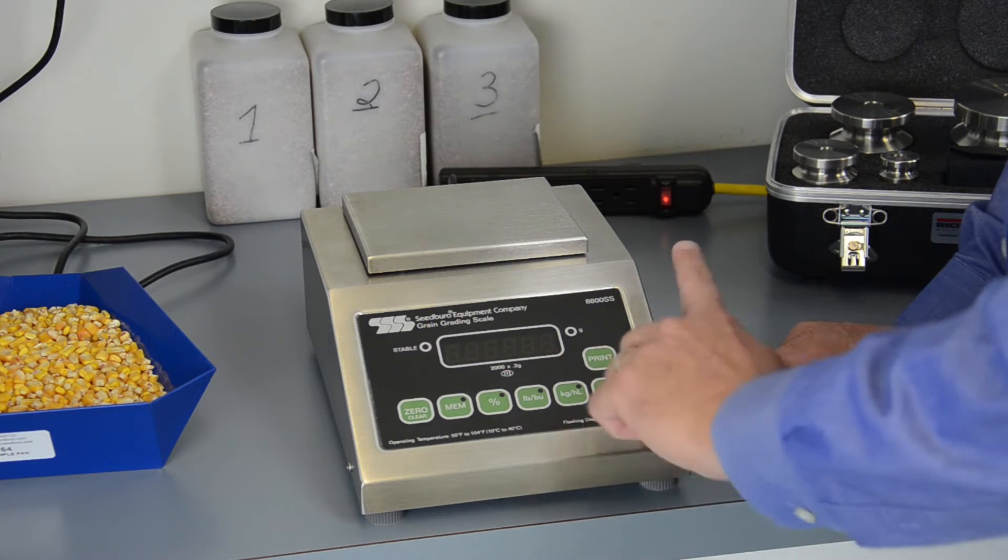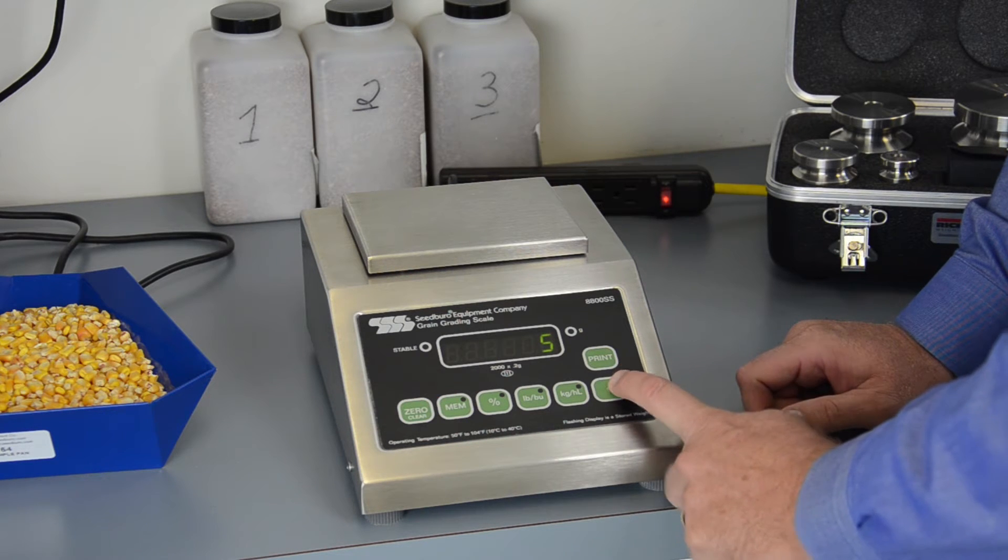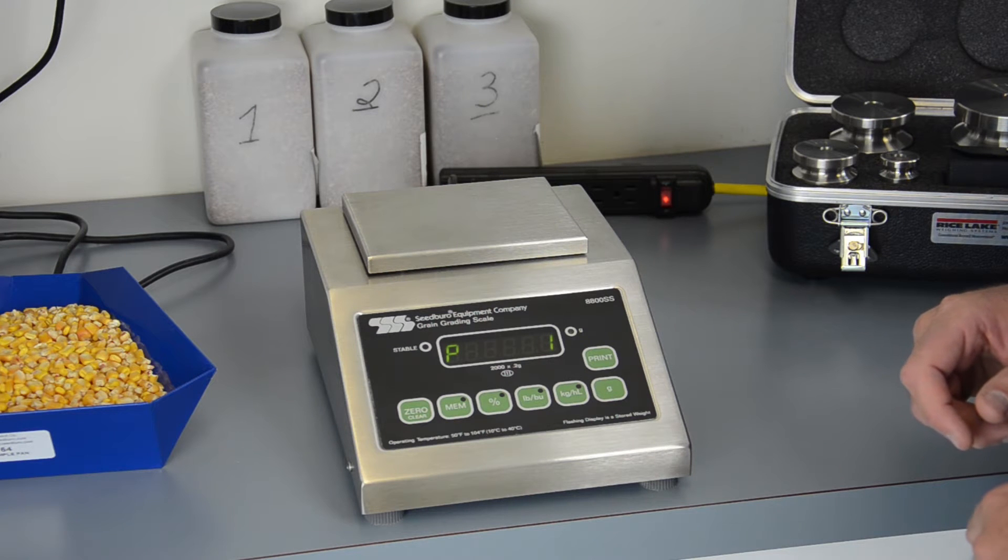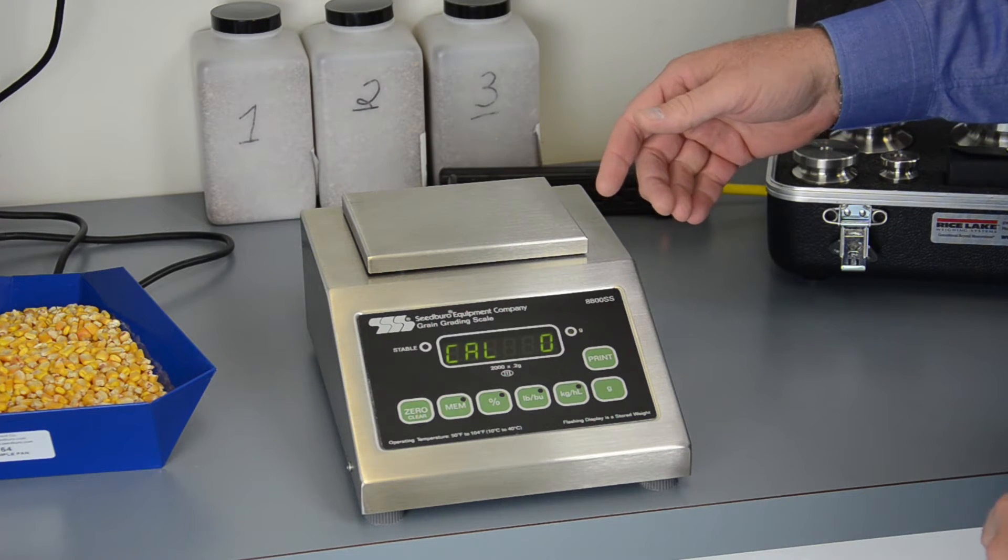It'll go blank, and you then push zero five times. It will show how many times, and then push the gram button. At this point, the instrument will go through the calibration process and set up for calibration.